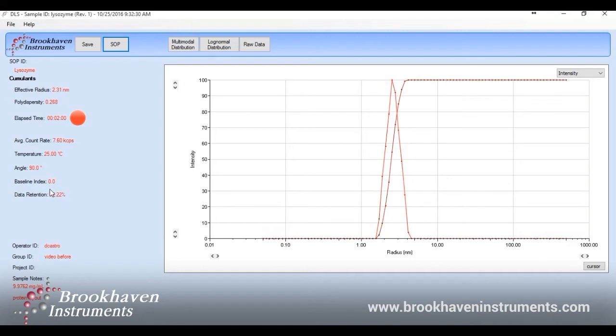An important parameter to note is the data retention percentage. With the dust filter on, the data retention rate is 72.22%. That's the percentage of points the software considered to be caused by the actual sample. Because this retention rate is on the low side, this is an indicator that the sample does need to be modified to yield better results.